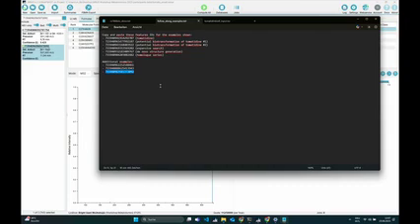Right now it's only CID. We are working on HCD right now. It looks promising. Like in the other workshop right now, Nicola Zamboni has tried a bit, and with some minor modification on the scoring, it works quite well. EAD. Sorry for that.